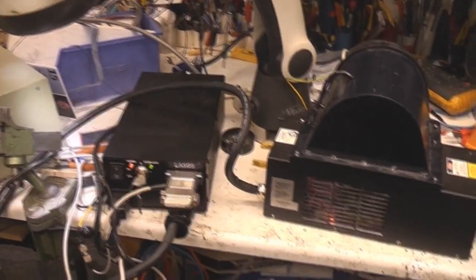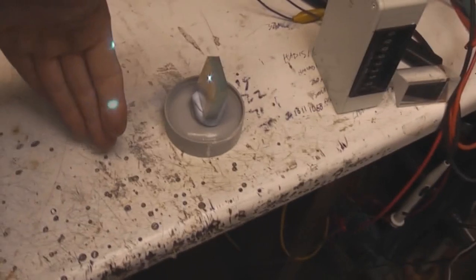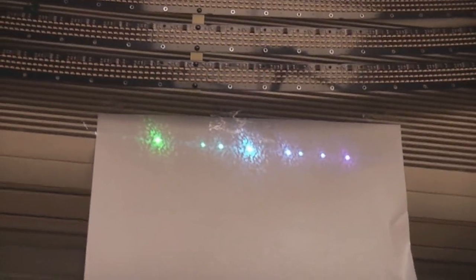Right, so I've managed to get this argon laser fired up. I'll just quickly go through this and then turn it off because the fan's so noisy. I've just got it firing out, so you've got this nice sort of turquoisey blue beam. I'm pointing at a diffraction grating so you can actually see the 8 argon lines from sort of green up to fairly deep blue.